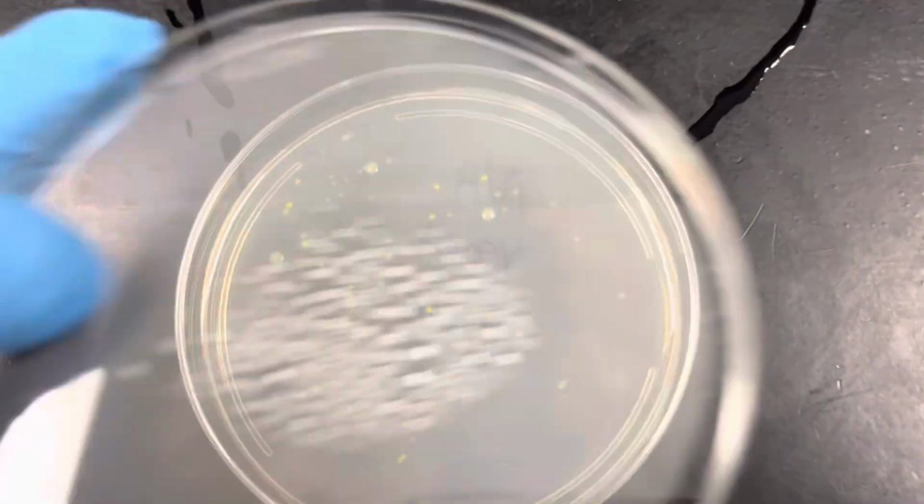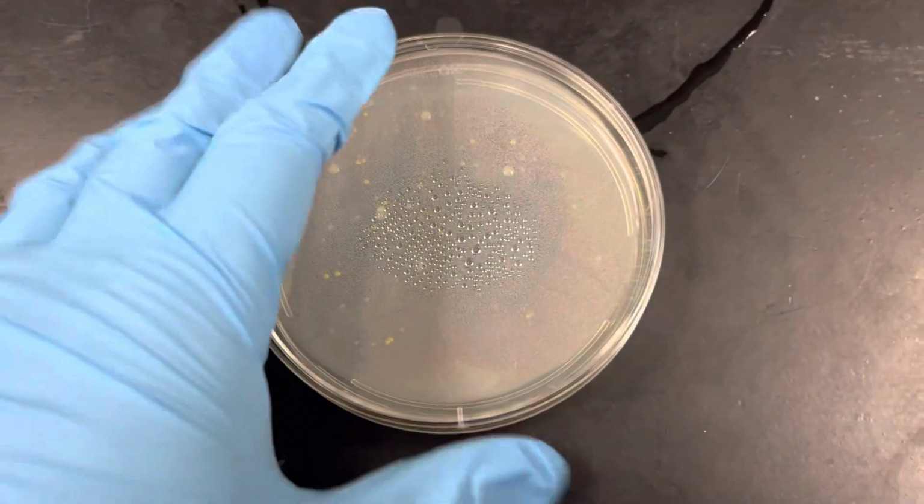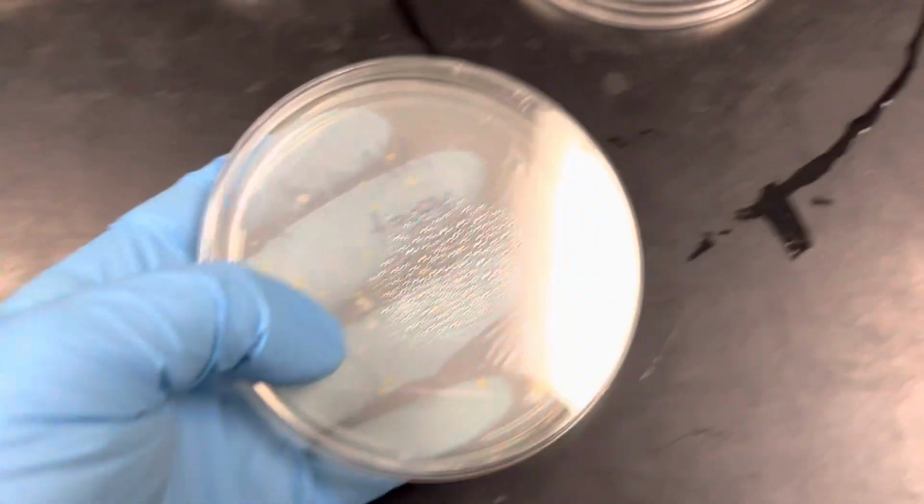So that shows you what you should be counting when you count the colony forming units only of the yeast on your dilution plates if you also happen to grow bacteria along with them.